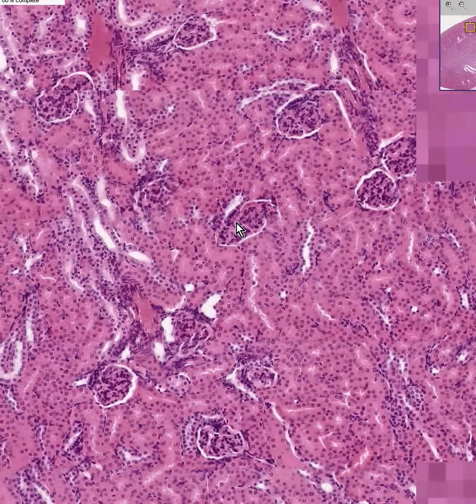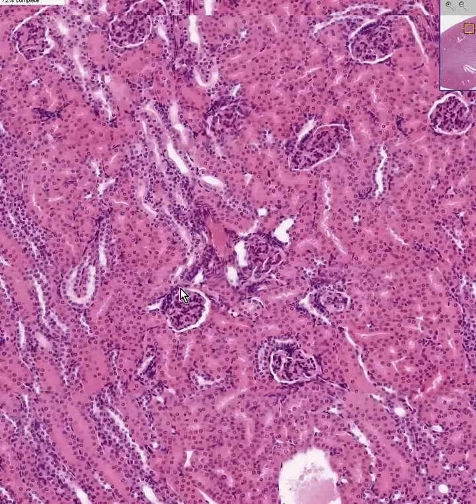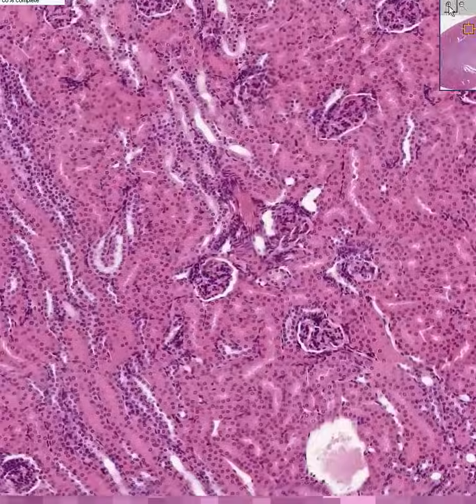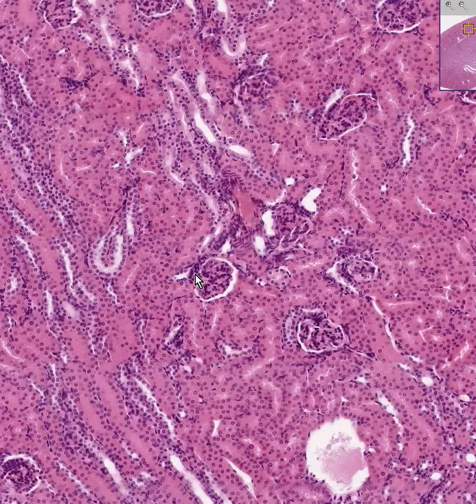The glomeruli always have a free end completely surrounded by space — that is called the urinary pole — and an area of attachment to blood vessels called the vascular pole. If you're lucky at the vascular pole, you may see structures with a lumen, which would be the portion of the distal convoluted tubule coming into proximity with the vascular pole to form the so-called juxtaglomerular apparatus.